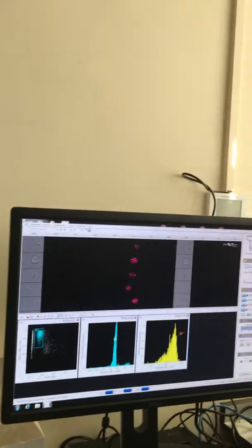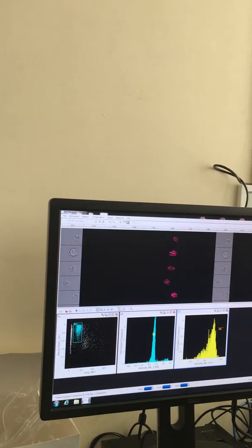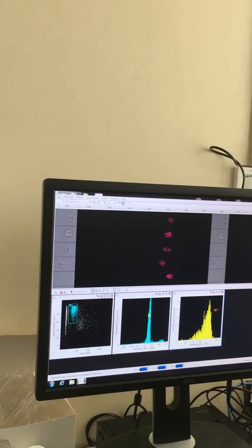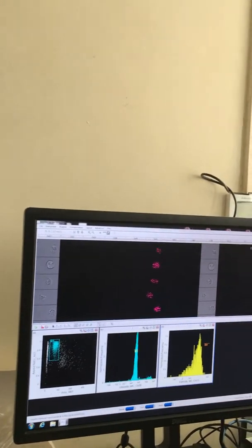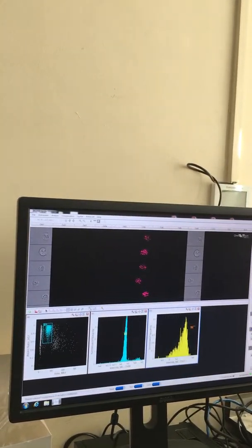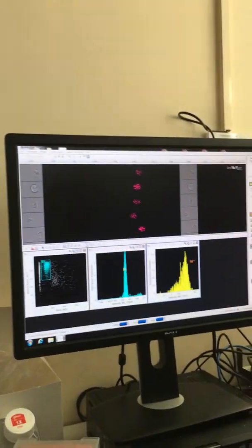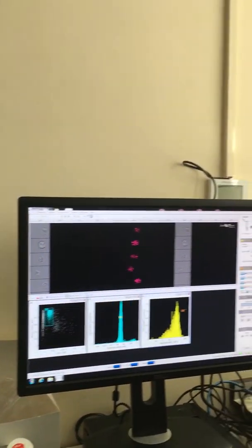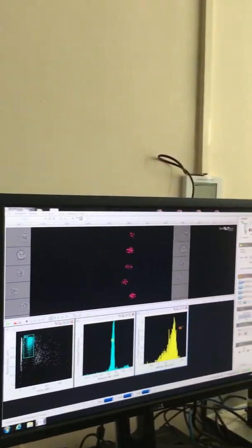Okay, and then you want to go to load. Or maybe I call it Adam 17. Yeah, I think I call it Adam 17. And then hit load. Is it good like this? That'd be alright. It should have like vortex. Be nice.